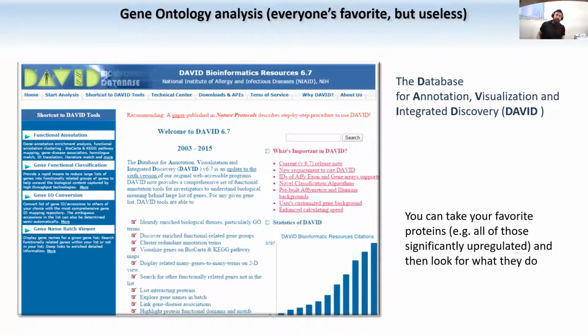And now, let's say that we have plotted our data, and we found that there is a number of proteins that are significantly regulated in our data set, right? So now, what do we do? How do we start exploring what are the properties of those proteins, even though we know nothing about them? And like I told you, there are all of these databases that contain a lot of information in terms of annotations of different proteins. Even if you have an organism that is very poorly characterized, you can blast the protein sequences of this organism, and then you can retrieve annotations from, let's say, human proteins that are the most similar to that protein. It's not perfect, of course, done this way, but it helps you to get a feeling in terms of bulks of regulated proteins.